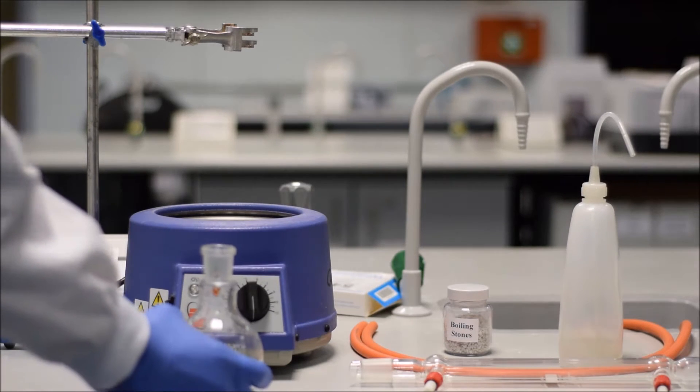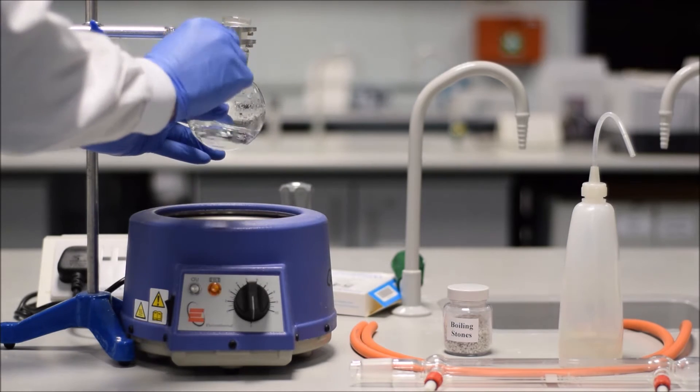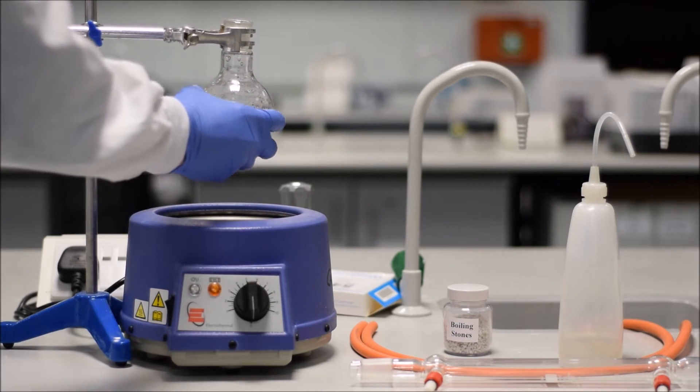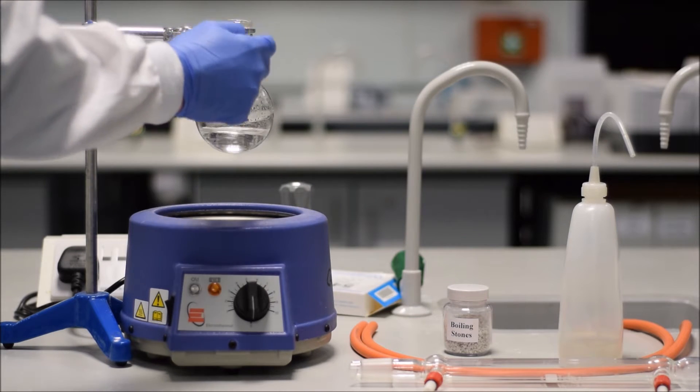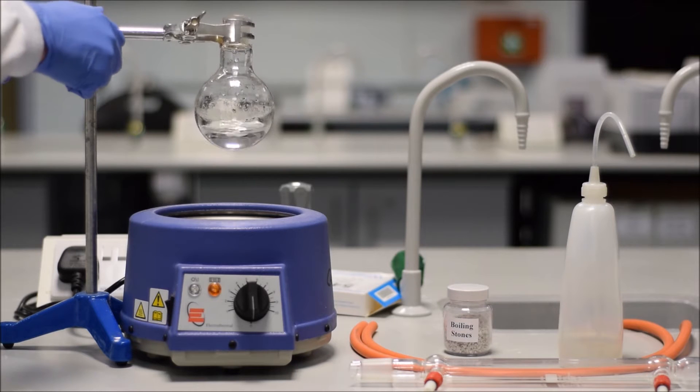The first and most important part of all of this is that your flask is securely clamped. There's a whole bunch of reasons why this is important, but if you're going to securely clamp it, clamp it around the neck like so, and make sure that it's not going to fall out. You can see that it's still free to rotate, but it's well held.